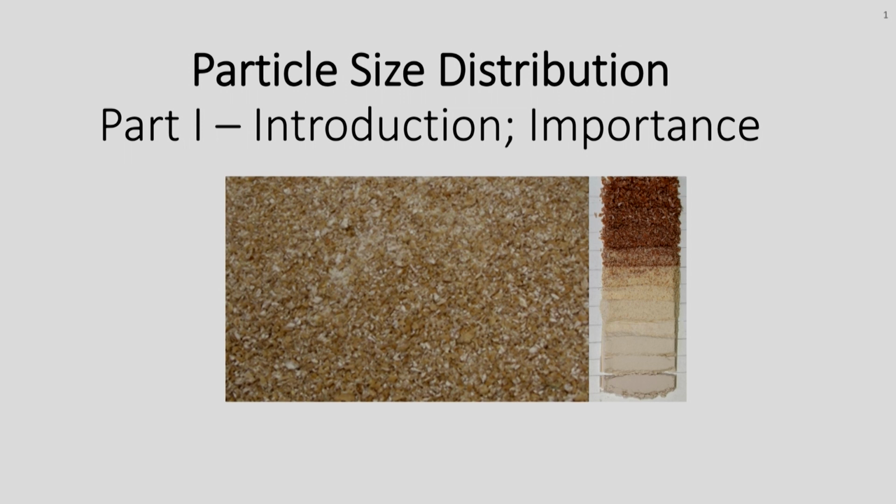Talk briefly about particle size distribution, and then we'll go to particle shape characterization. So particle size distribution, I'm giving a sample here, right? Everyone guess what the sample is? Maize. Okay, very close. Wheat, exactly. So it's from wheat milling. So first break, wheat milling process.